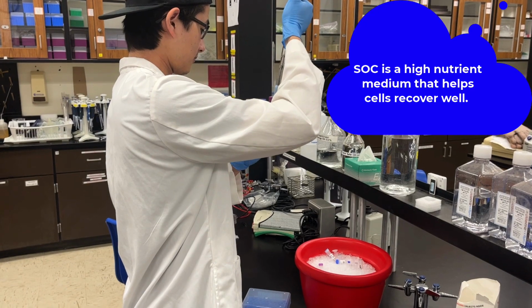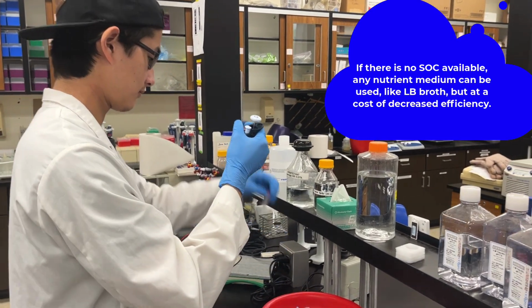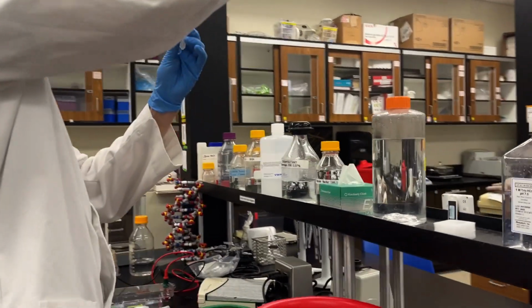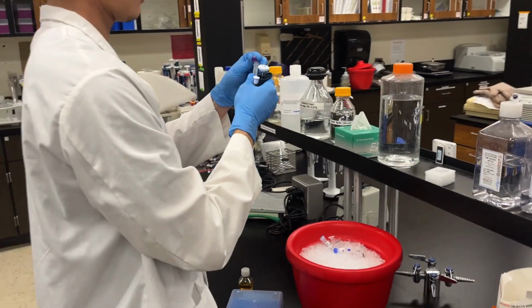The amount that we add can vary. I've seen as low as 150 microliters up to as high as 1 mL. We tend to use 450 microliters, which is a little bit on the high end, but again, it works for us, so that's what we're going to continue to do, at least for a little while. So gently pipette in the SOC medium, and then we're going to incubate it.